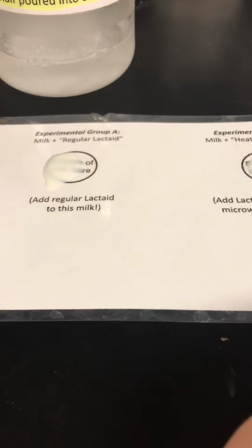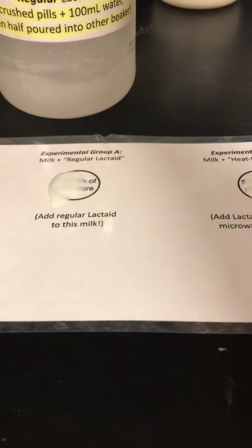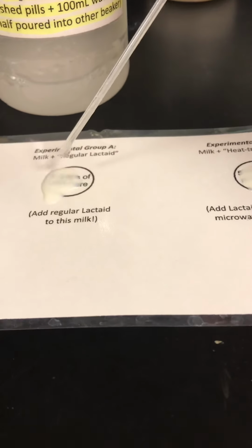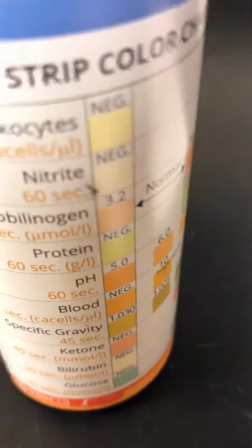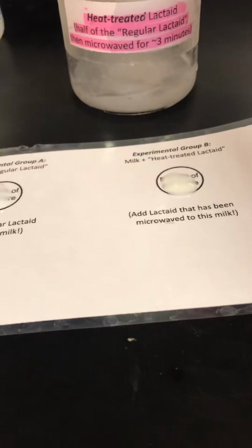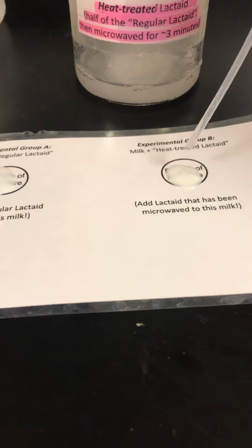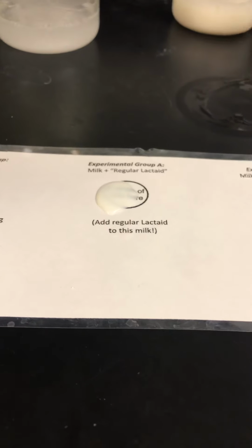And then we're going to add in our regular Lactaid to our second one. We're going to do 5 drops. Okay. And then our heat-treated Lactaid. Let's see if it's cool. Yep, that's pretty much room temperature. Going to add our heat-treated Lactaid to the last one. Okay, now we're going to let them sit for a little minute.